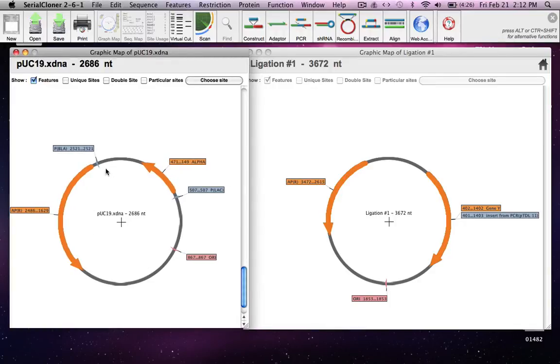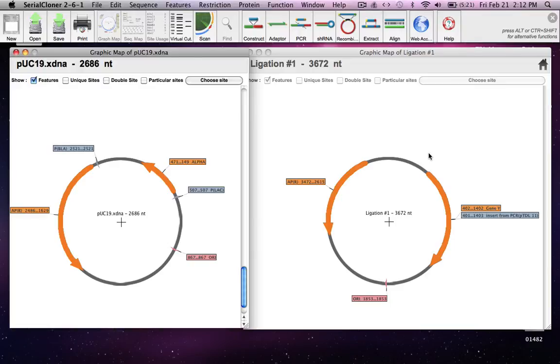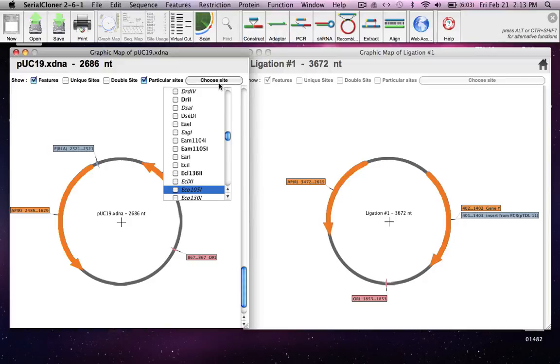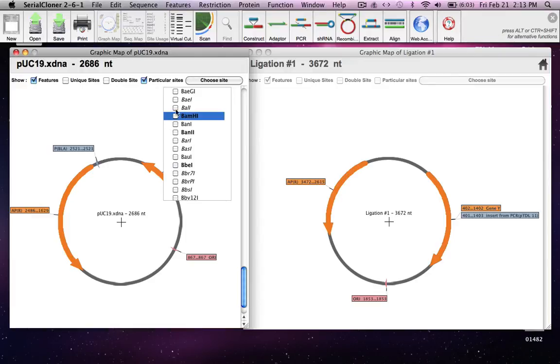As you can see, PUC19 has the ampicillin resistance gene, which is retained in our construct. However, the alpha gene portion is missing in our construct — it is replaced by gene Y, which is our PCR product insert. This happens because the alpha gene had ECO R1 and BAMH1 sites in its multiple cloning site, and when we inserted gene Y, the entire sequence of the alpha gene as recognized by the program changed. The program no longer recognizes the broken fragment of alpha gene, so it just shows gene Y with alpha gone from the picture.